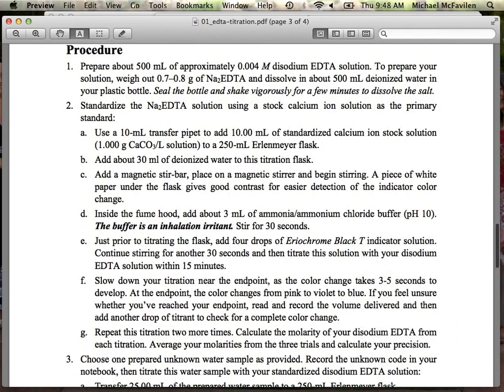Ammonia is actually toxic, so watch out for that. Be aware of it. The toxicity level is like 1,000 times higher than what you can smell. So if you're smelling it, it just means you shouldn't continue to smell it. And you should be fine. It is found in all sorts of cleaners and stuff like that, so it's not that big of a deal. Just be aware that you shouldn't be huffing it, because it's not a good thing to do.